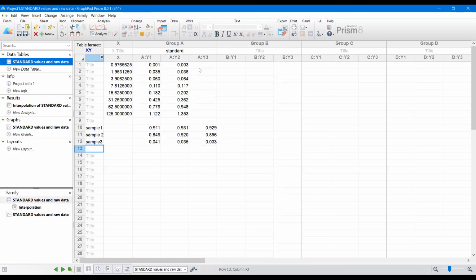In some cases, if you take a look here, your sample 3 was these values, and based on that I would say that it is something between these. But the problem is that it was not stable enough, so that's why the program does not give you any values.